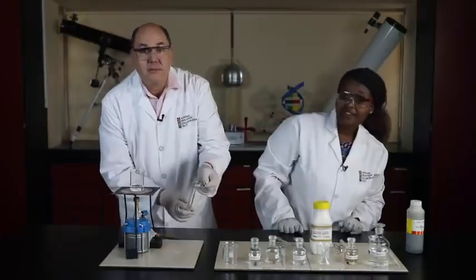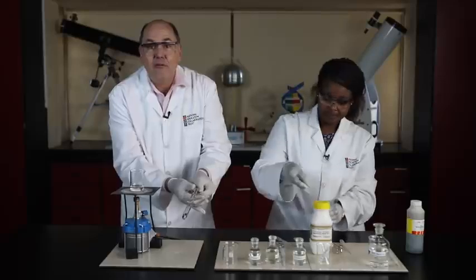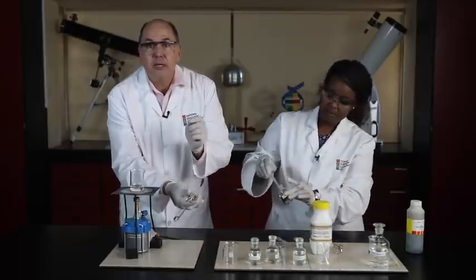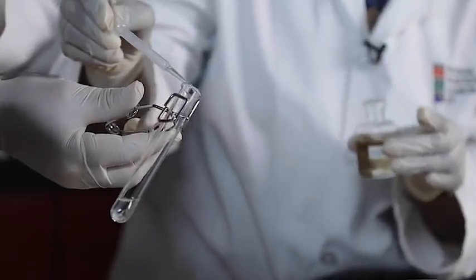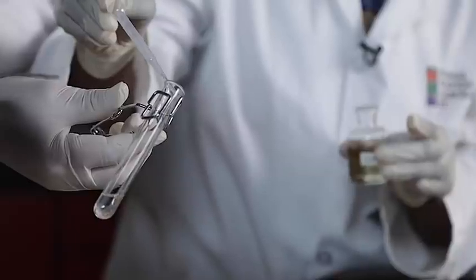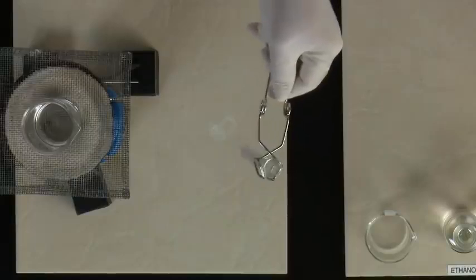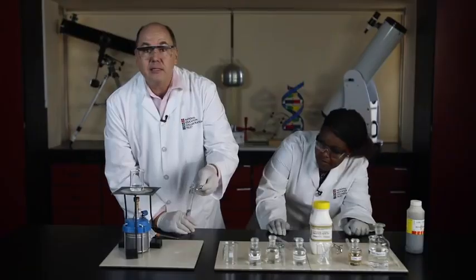What shall we do next, Joyce? Finally, we add the catalyst. We carefully add a few drops of concentrated sulfuric acid to the mixture, dripping it down the sides of the test tube. Here we go. It's 1 drop, 2 drops, and another one to make sure everything reacts. A couple of bubbles there. It looks like it might even be reacting.